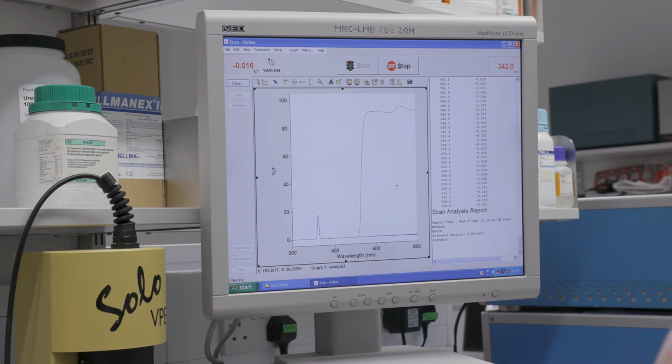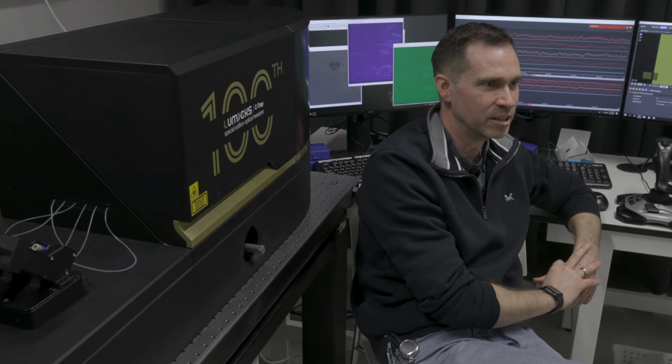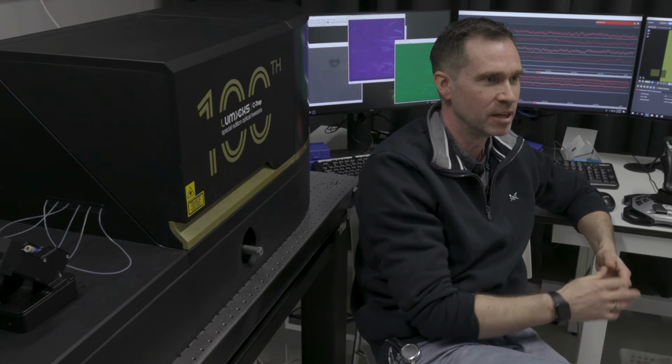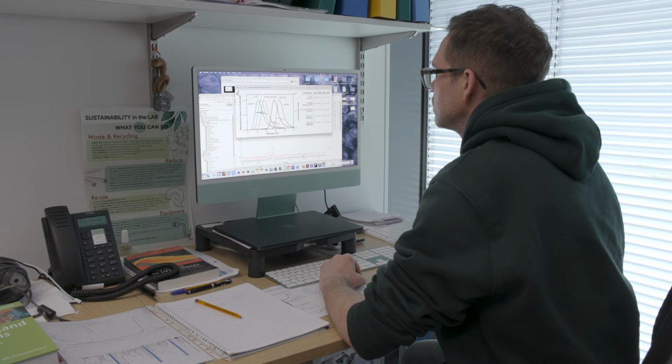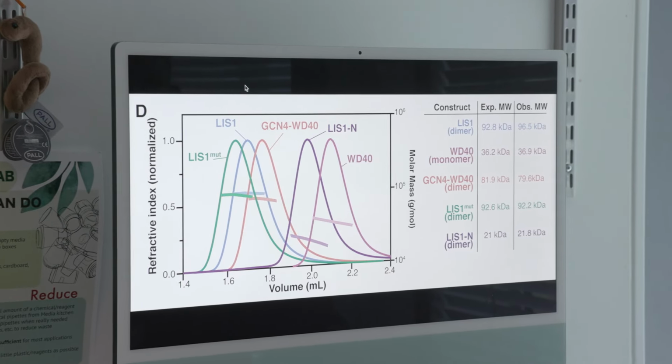So what's exciting about biophysics? With biophysics, often it's a very exact answer. Someone comes to us and they want to know if they've got a complex, if it's a dimer, if it's a trimer, and we've got a piece of equipment where we can give them an exact answer. And that's quite nice to do.